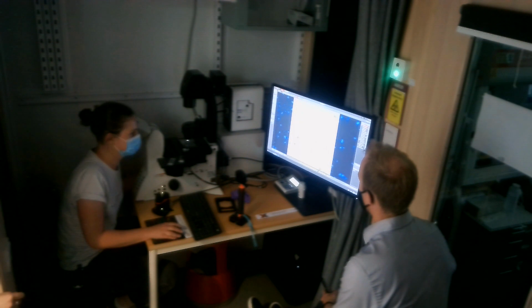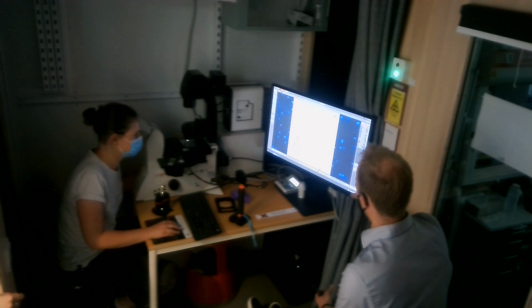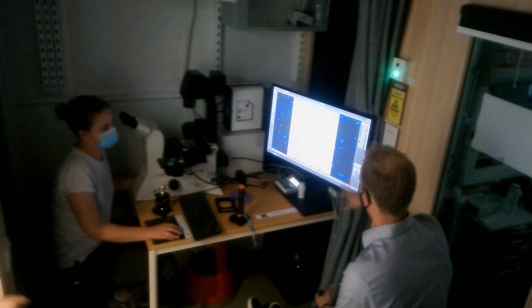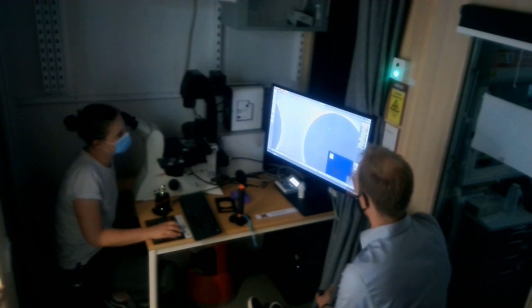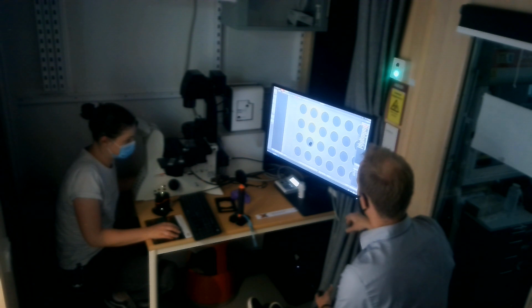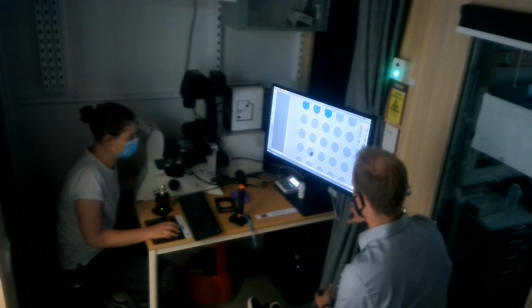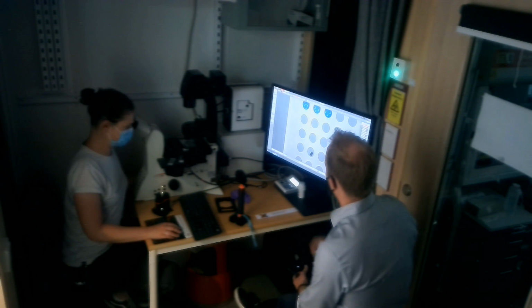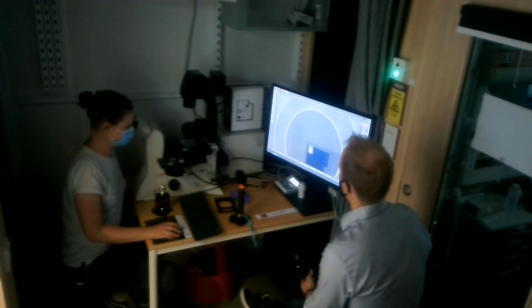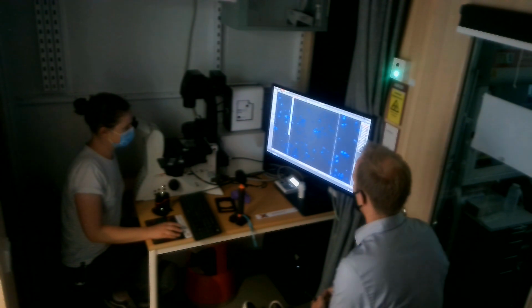Okay, but if I now would want to take both together as an overlay, I would just go and start, or capture image. Right now you have this thing. So right now the start would capture all of these things that we did before, because I still have up here all of that. It will start all of that. So when you're done, you can remove this by just clicking on that. And now if you click start, I don't think actually anything will happen, because there's no task list. Well, it did do something. Okay, I would stop that. That was interesting. So now I would double click to get back there. And then instead you could either mark this position, or if you just want to capture it, you could do capture image. And that one will take this image with the 2.